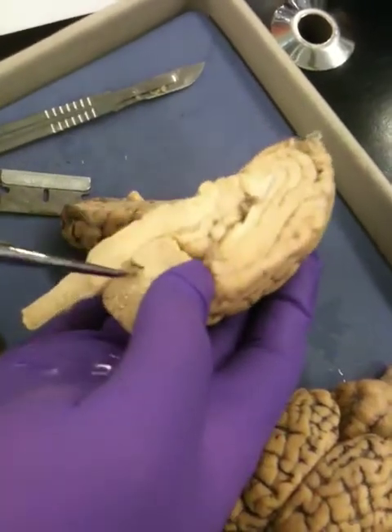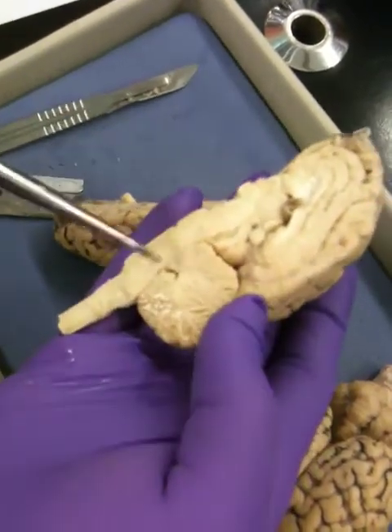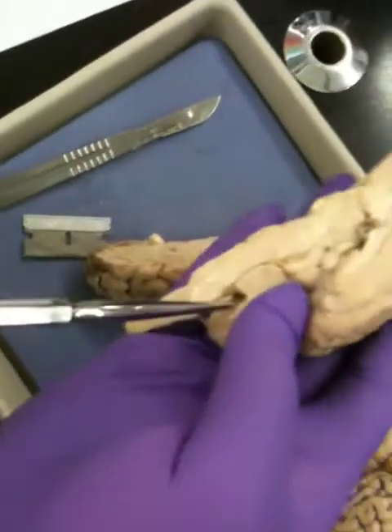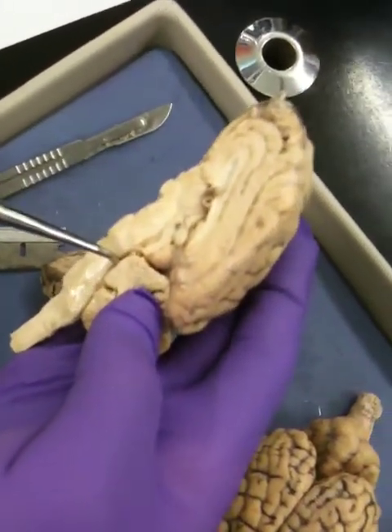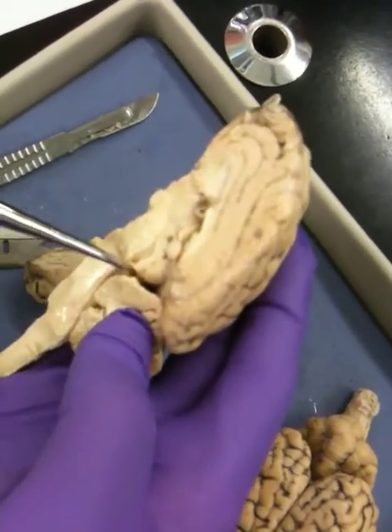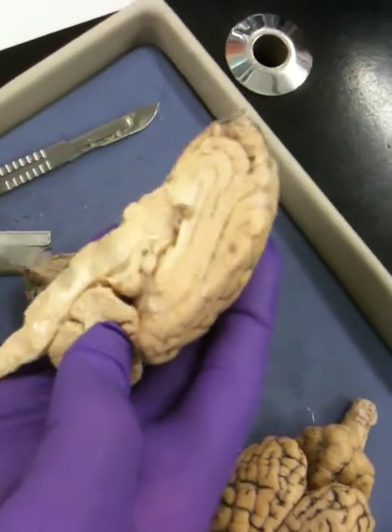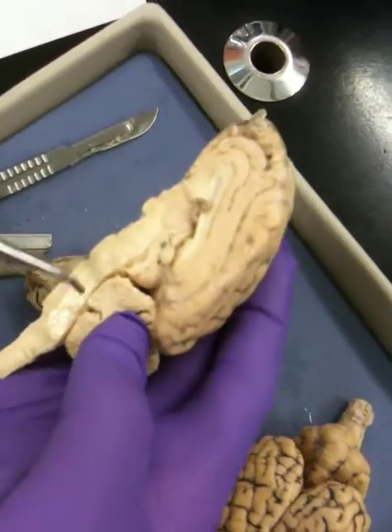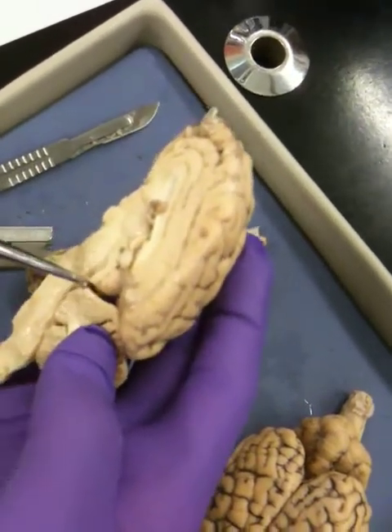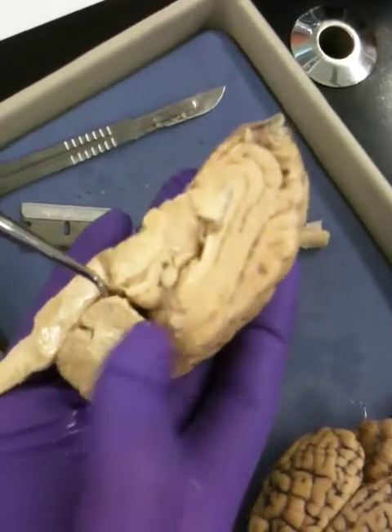This is the fourth ventricle, this little space here on the cerebellum. Notice that it's not open until I put the probe in there, because I know exactly where it is and I can open it up. You see the ventricle? So there's another one right here. This is called the cerebral aqueduct. Basically, it comes all the way up here and connects the third ventricle with the fourth ventricle. I think your book calls it the mesencephalic aqueduct, which is the same thing.